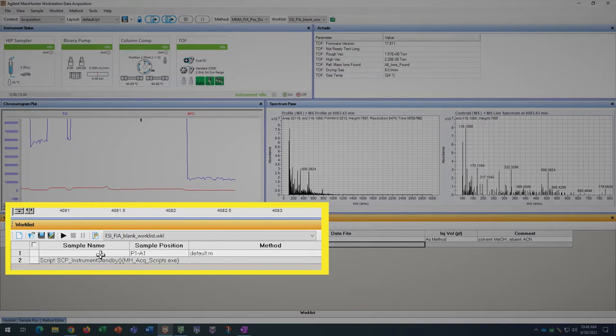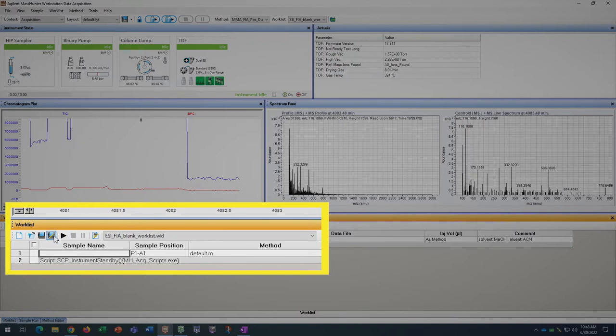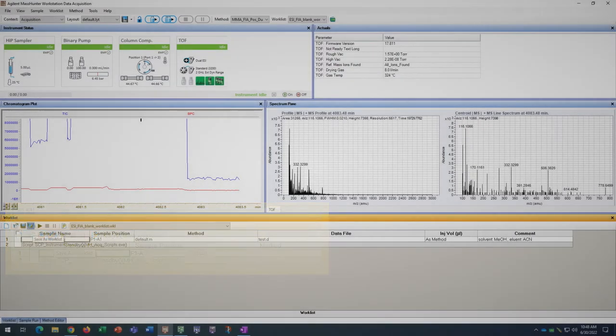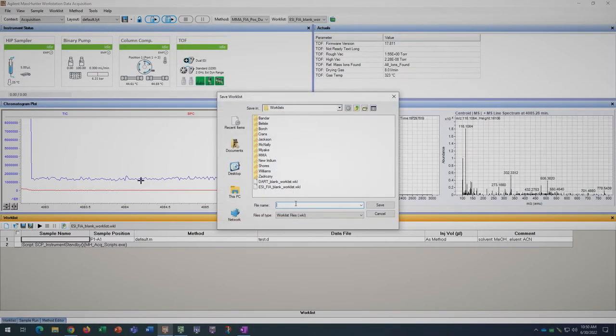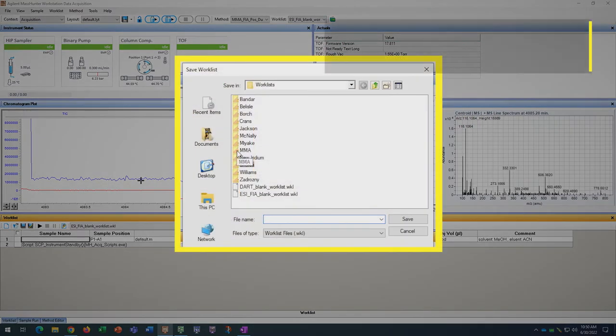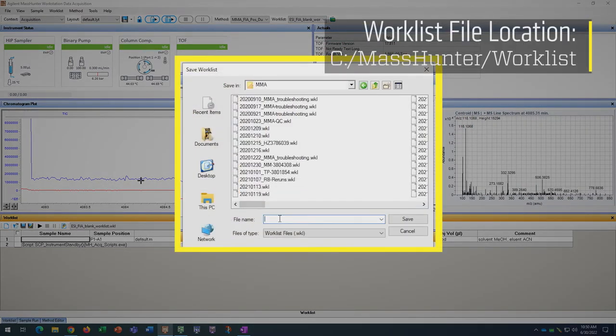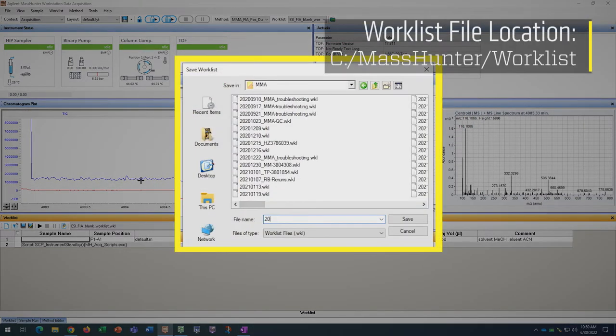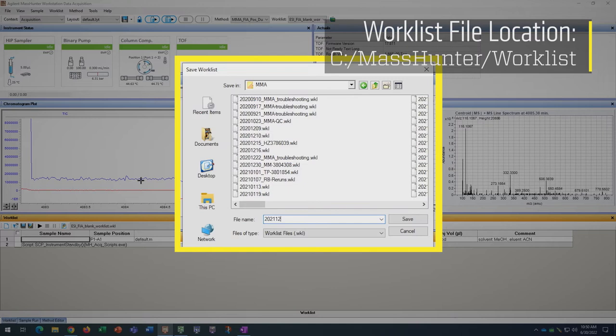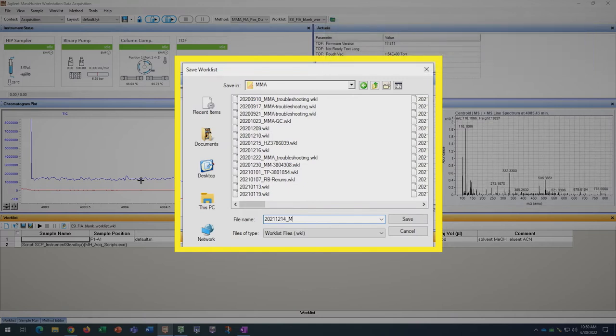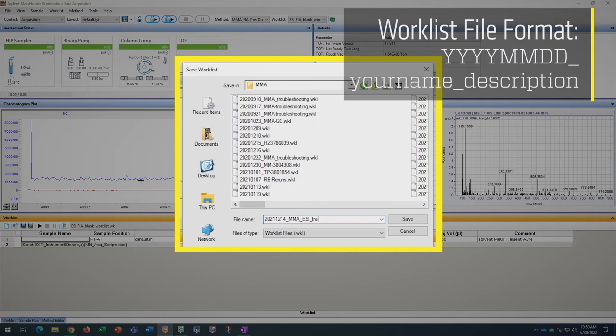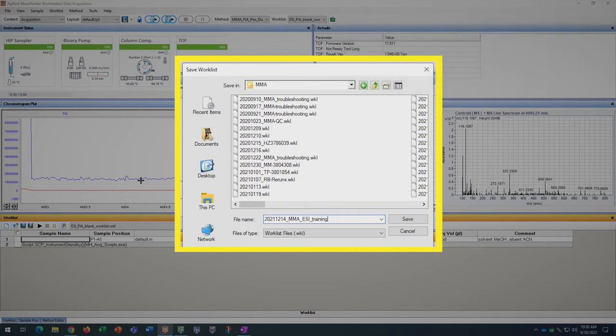If you use an old worklist or the blank worklist, please save as a new worklist before you make any changes to the old one. Today's worklist will be called 2021-12-14-MMA-ESI-training. Your worklist should be saved in the worklists folder starting with the date in the YYYYMMDD format.